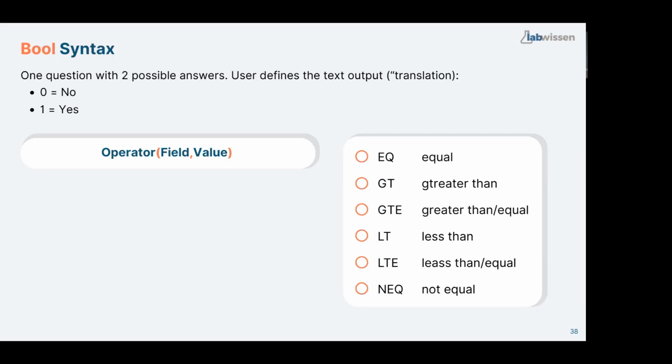So if I ask, is my area greater than 100, or if I ask, is my area greater than or equal to 100, I don't think it will make a big difference. It's more like GMP. From a GMP point of view, I need to include also area 100 in my calculation. But you really need area 100 and 11 more zeros after it to be equal. Or you can use round values. There is a function where we get round, so we can round values, and then use these values for further calculations.